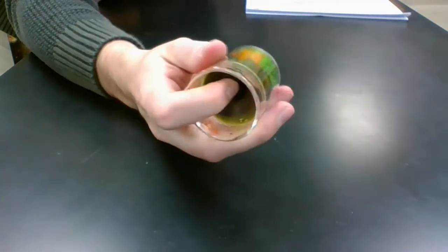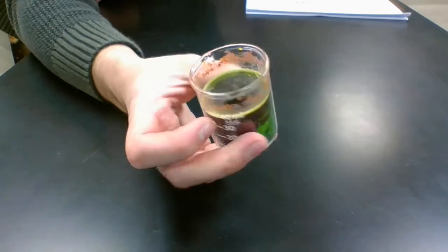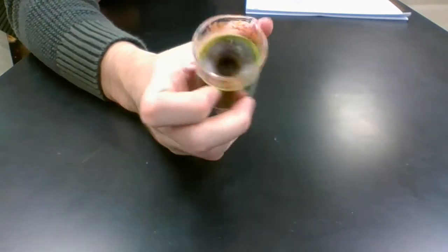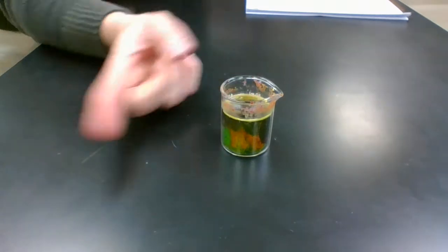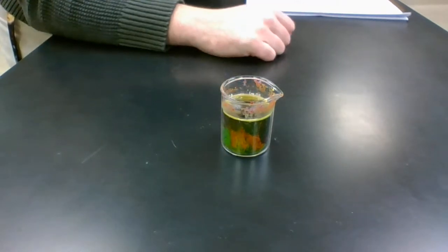Now, this has solidified and it's back to being like wax, like a crayon would be. Okay, it looks a little bit different, but I mean, it's still wax. It's still that crayon material. So that might tell you something about whether the melting process and the solidifying back into a solid was a physical change or a chemical change.